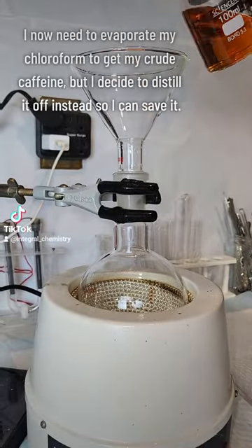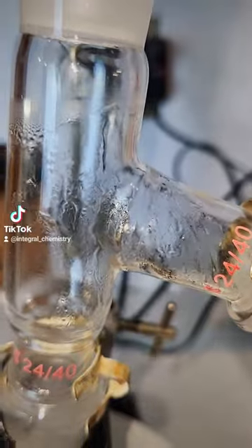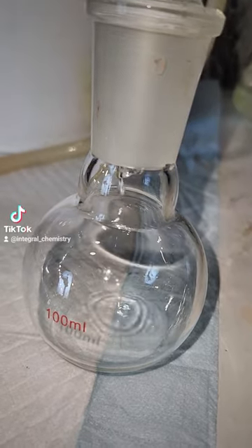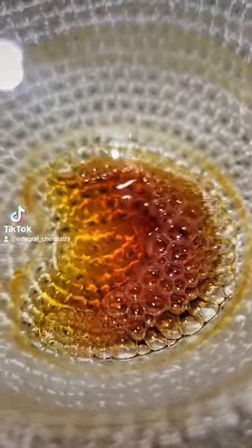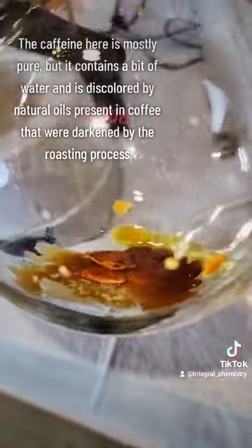I now need to evaporate my chloroform to get my crude caffeine, but I decide to distill it off instead so I can save it, because chloroform is kind of annoying to make and I don't really want to waste it. A rotary evaporator would be ideal here, but a core focus of this channel is to make chemistry as accessible as possible, and a rotary evaporator is not a very accessible piece of equipment — while all my glassware here was a couple hundred dollars, a rotary evaporator would be a couple thousand.